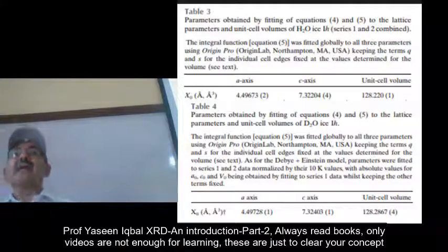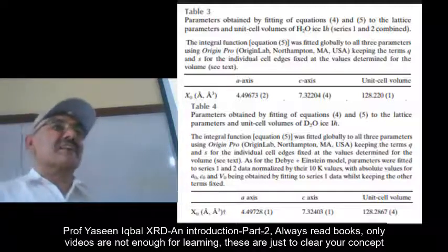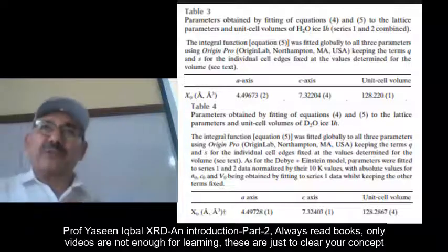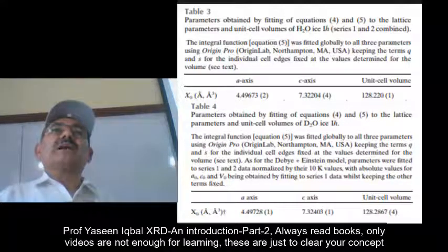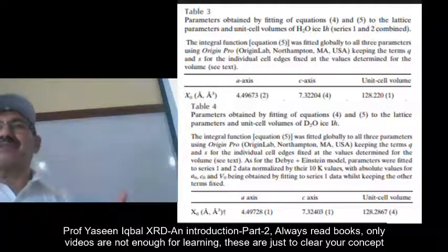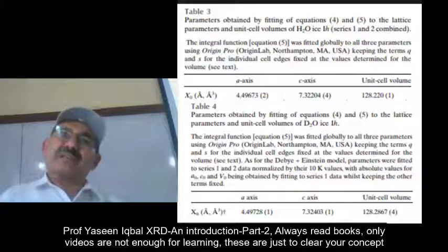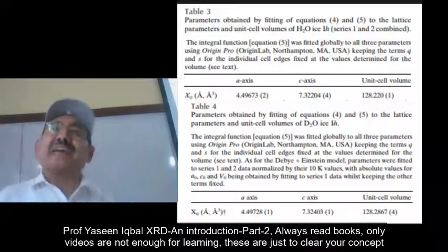If the whole research project is characterization and properties of a sample, X-ray takes 1 hour per sample, 10 samples in 10 hours. Properties, sample preparation, a sample can be prepared for XRD in a few minutes. It is not a difficult thing. Either polished or ground into powder using pestle and mortar or any other grinder to take it to that small particle size. Properties may hardly take a day.